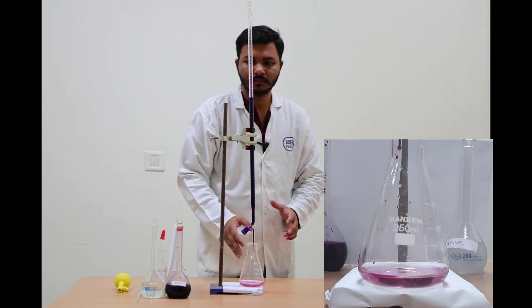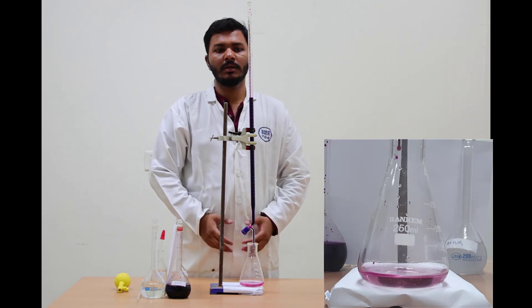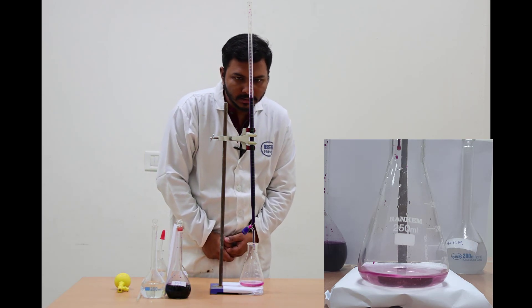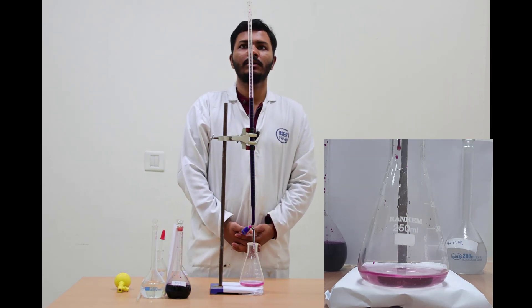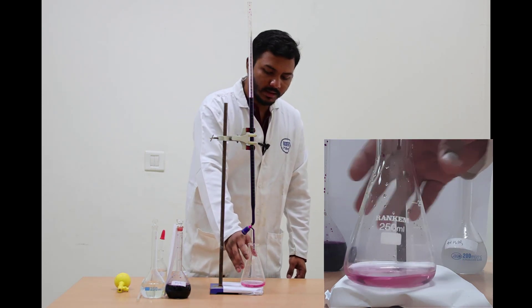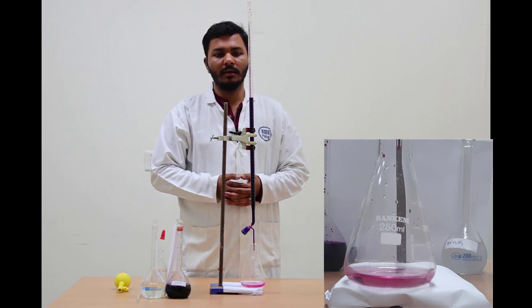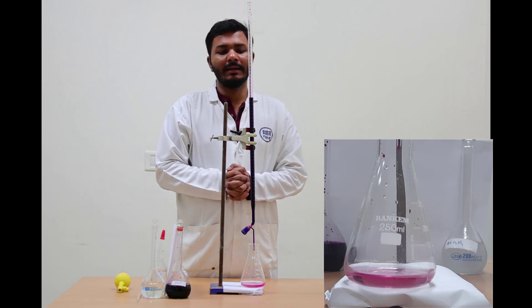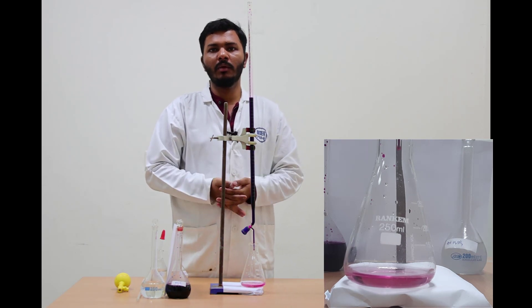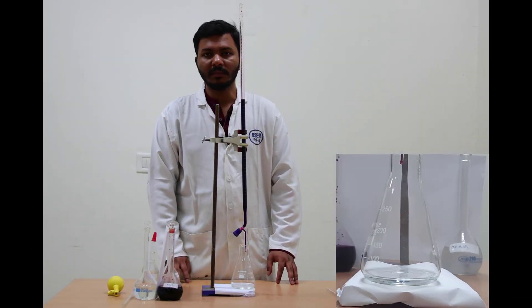The faint pink color was observed and the burette reading was 19.6. In this case, the previous initial reading was 9.5 and the final reading was 19.6, which gives us approximately 10.1 ml.